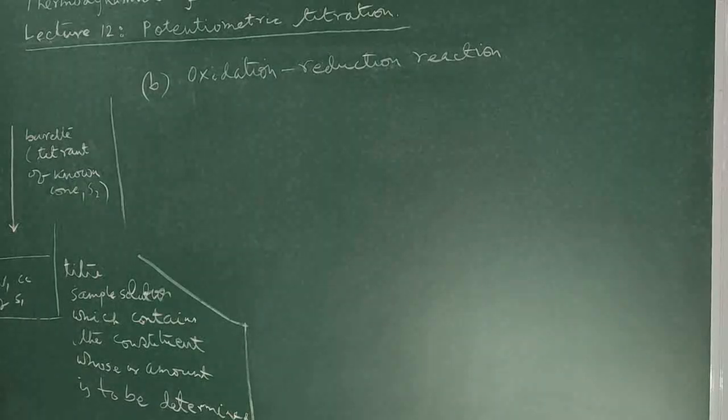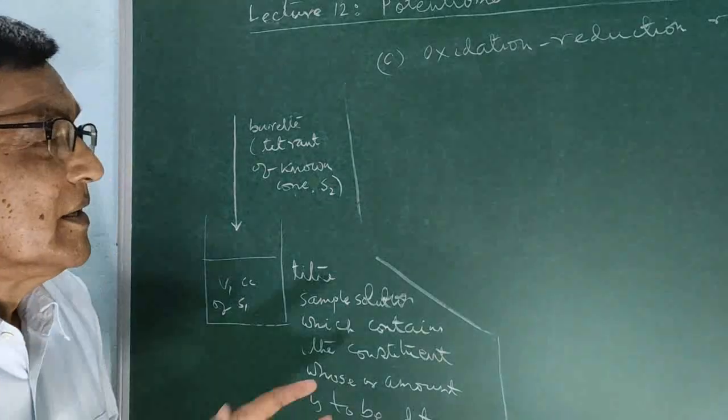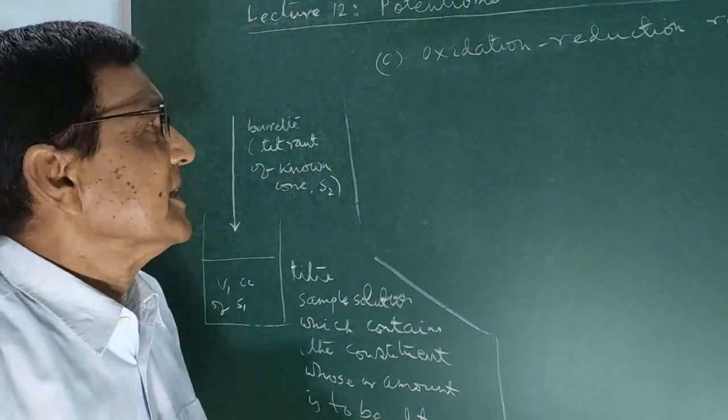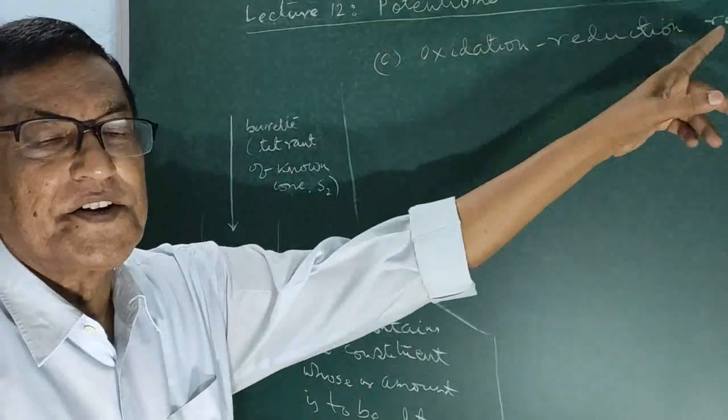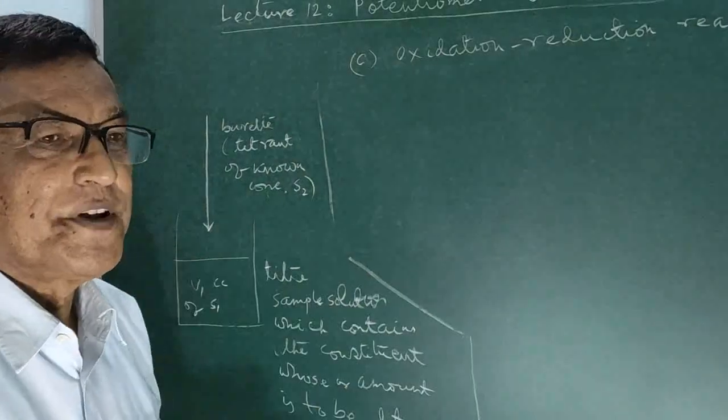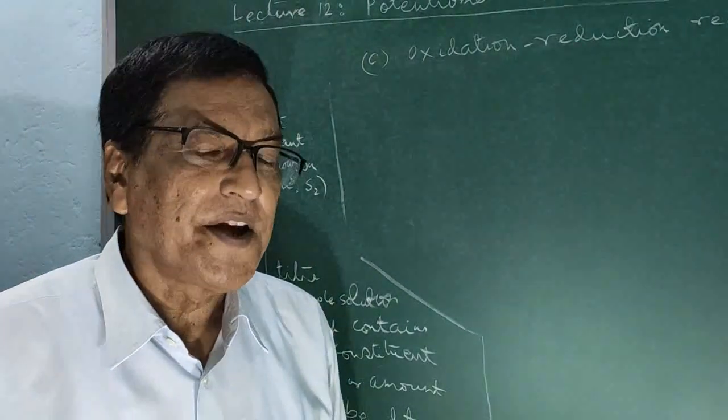In this case, the third type of reactions, oxidation-reduction reactions, and potentiometrically this type of reactions could also be titrated.